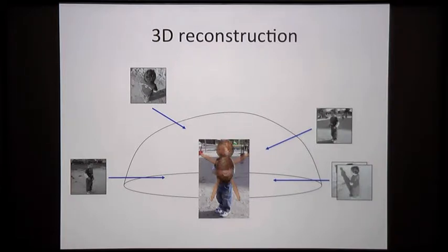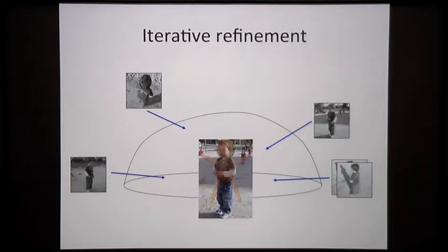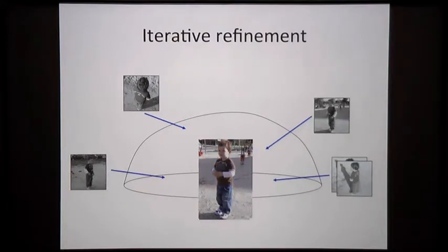Now we have something which is actually not perfect yet, because the same happens as with the bad initial penguin image: our reference wasn't perfect, our angles aren't perfect, and therefore our reconstruction isn't perfect. But again, it's hopefully better than what we had, and we can keep iterating until the angles converge to some point where hopefully we have a correct 3-dimensional reconstruction from our 2-dimensional images.